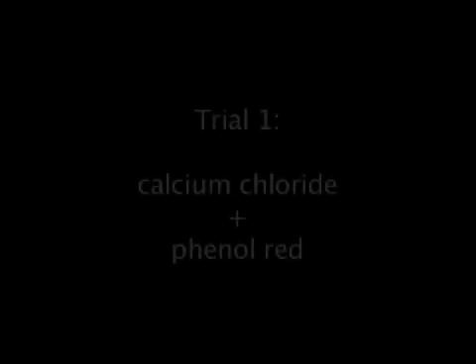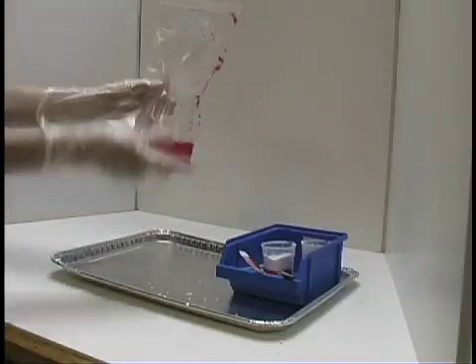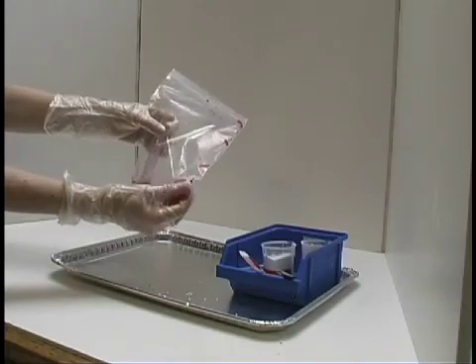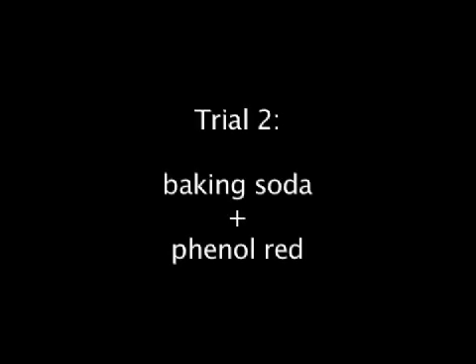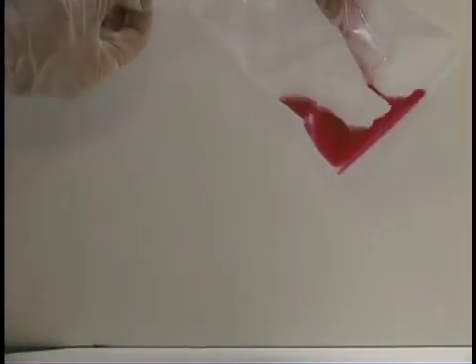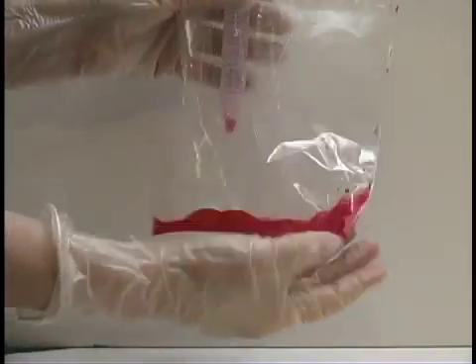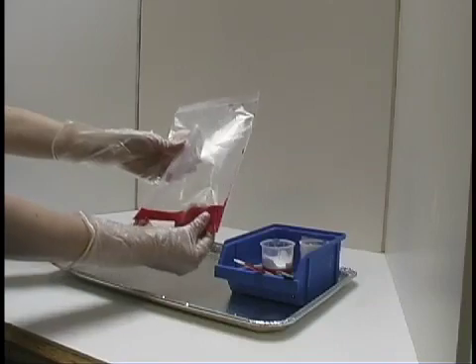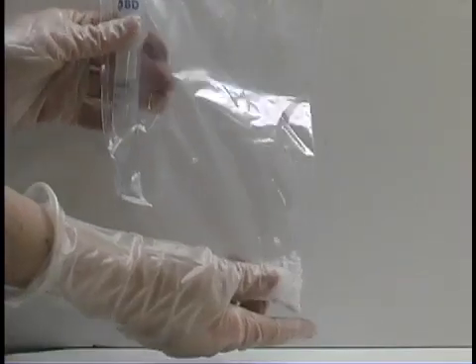Now we'll show the reactions that happen with different mixtures. Calcium chloride and phenol red turns magenta and heat is produced. Baking soda and phenol red turns magenta and feels cool to the touch. Calcium chloride and water produces heat.